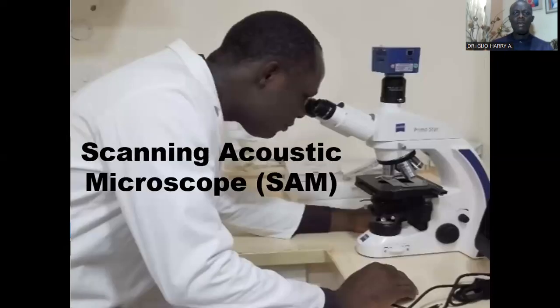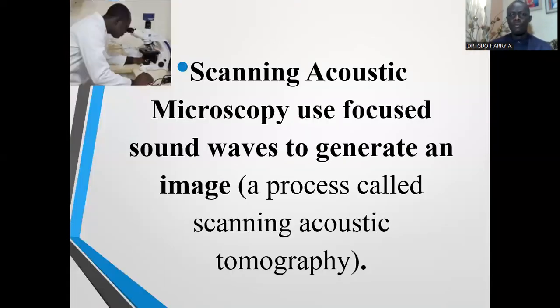Now I want to look at one important type of microscope, the microscope that uses sound waves. That's called the scanning acoustic microscope. What's the scanning acoustic microscope? Scanning acoustic microscopy uses focused sound waves to generate an image, a process called scanning acoustic tomography. So instead of using light, electrons, or X-rays, this microscope utilizes sound waves to generate an image.